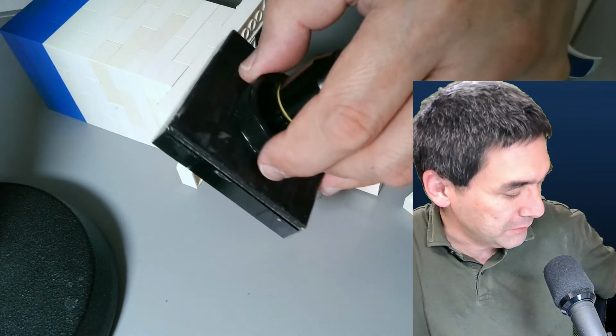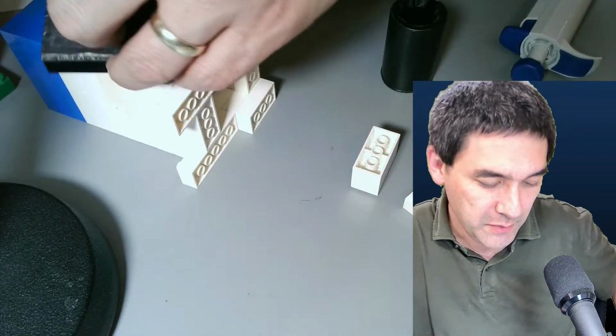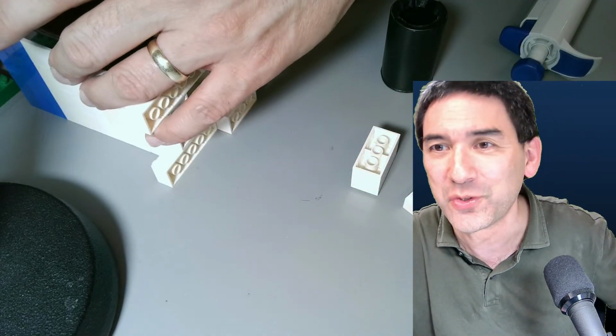Now I took it apart. I think I'm just going to leave it apart and put it away because I would like to show you a few other things here as well.